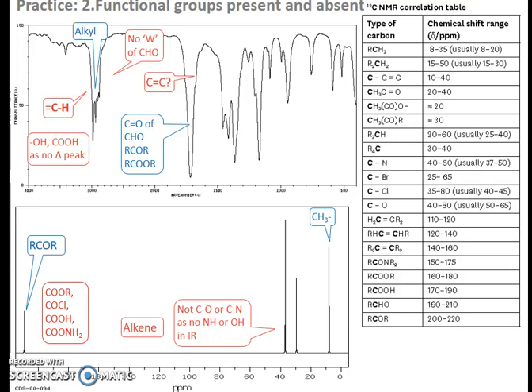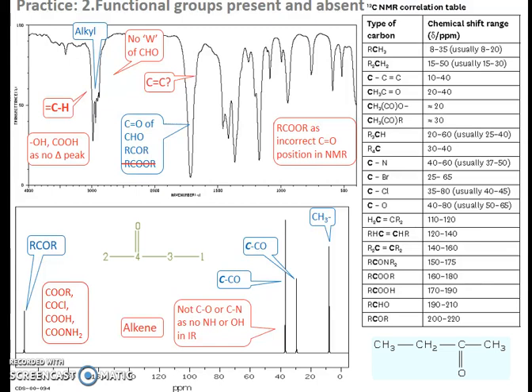It could be an aldehyde or a ketone, but at 210 ppm, it is more likely to be a ketone than an aldehyde. Particularly since there's no shoulder peak on the CH peak at the IR spectrum. It's almost certainly not an ester. So the logical conclusion is that we have, as I said, a ketone, four carbons. This one's butanone.